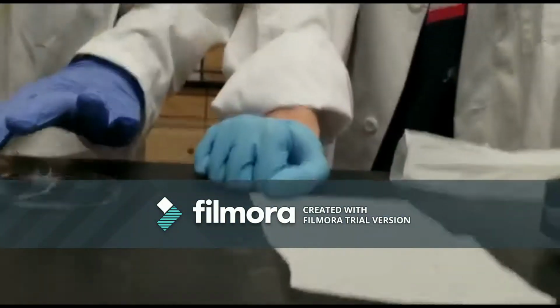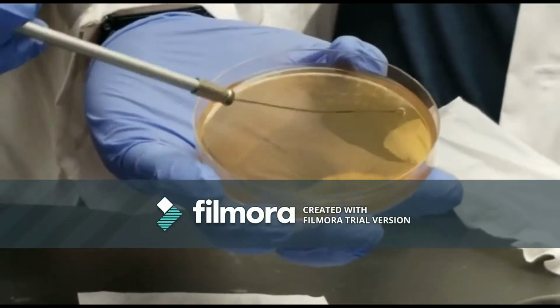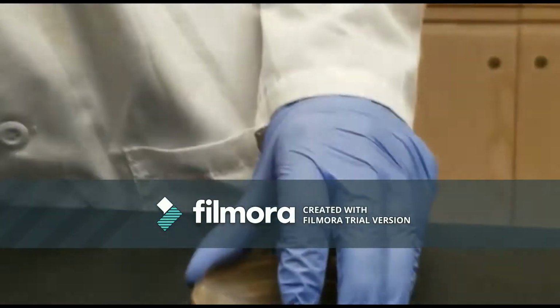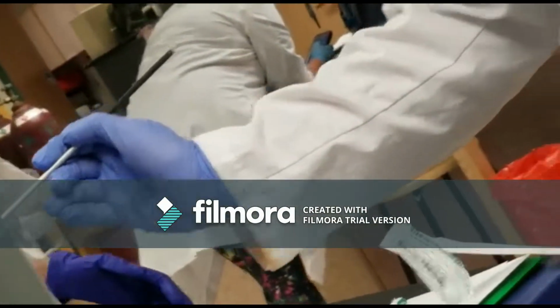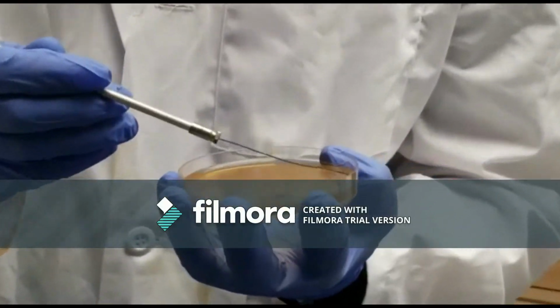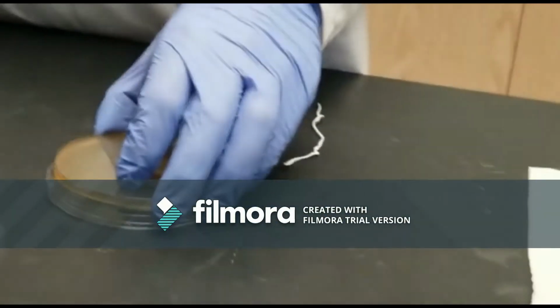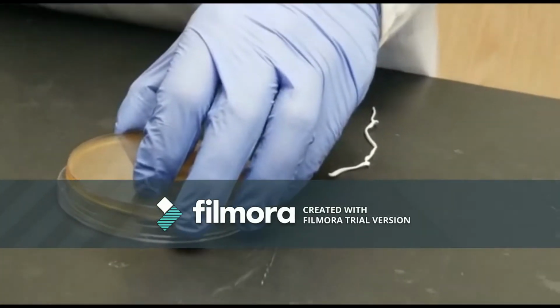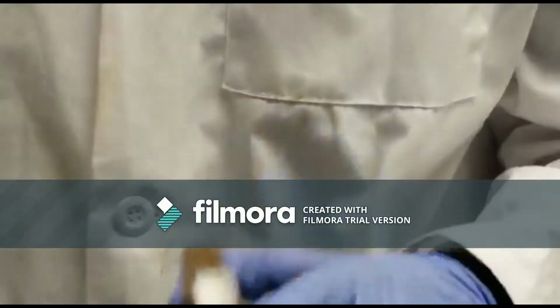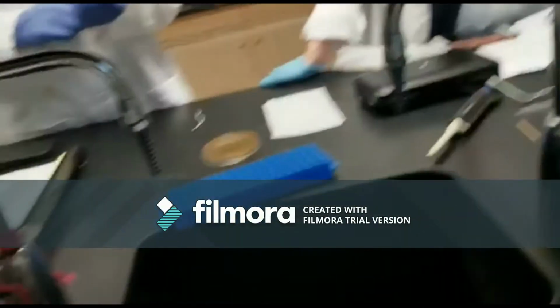The rest of the nutrient agar plate was streaked using the quadrant streaking method using an inoculating loop. The plate would be labeled and placed in the 28°C incubator for 24 hours and would then be moved to the cold room.